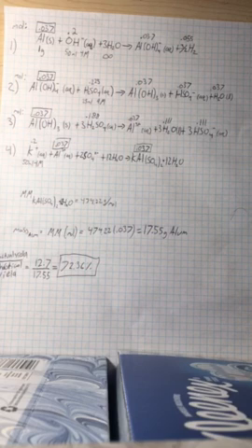Some of the reactions may not have been done to completion, which would lead to less product to be used in the next reaction. In addition, in the fourth reaction, when the ice bath is used to precipitate the crystal alum from the solution, not all of the alum may have been precipitated out, so some of it is lost in filtration.